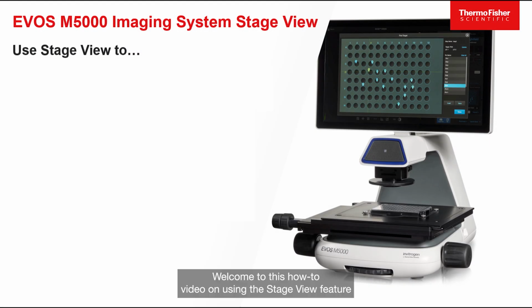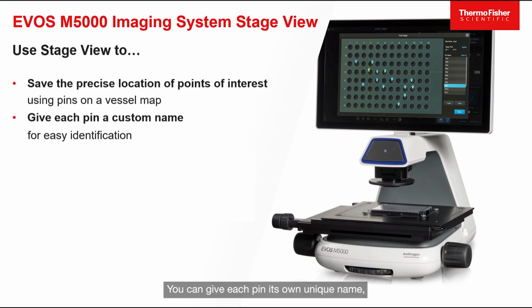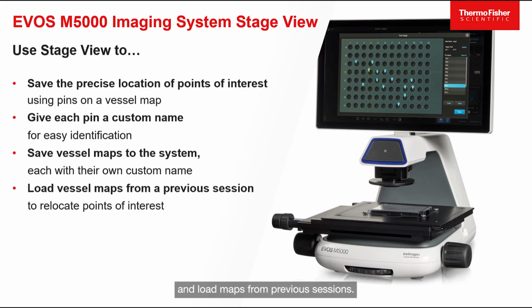Welcome to this how-to video on using the Stage View feature on the EVOS M5000 imaging system. Stage View allows users to save the precise location of points of interest using pins on a vessel map. You can give each pin its own unique name, save these maps to the system, and load maps from previous sessions.